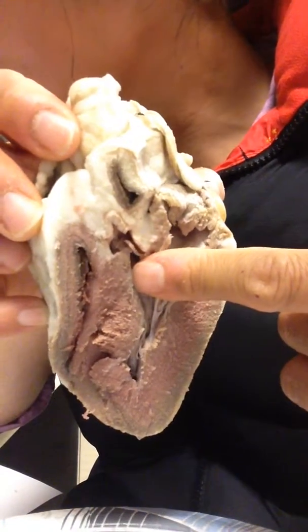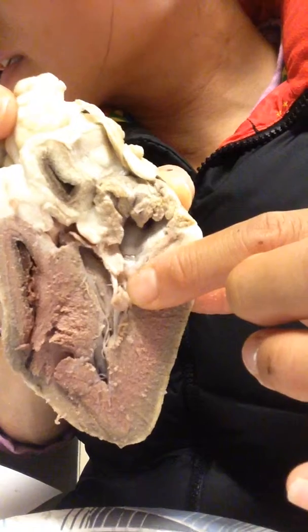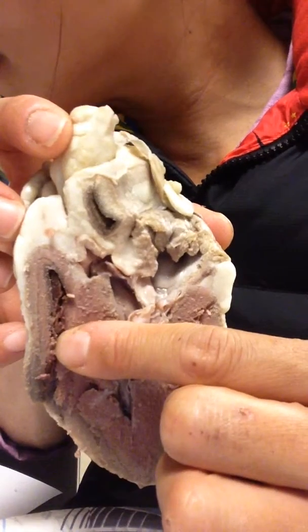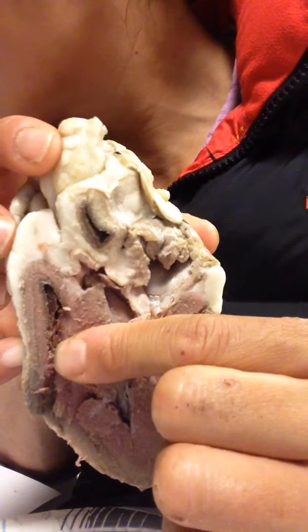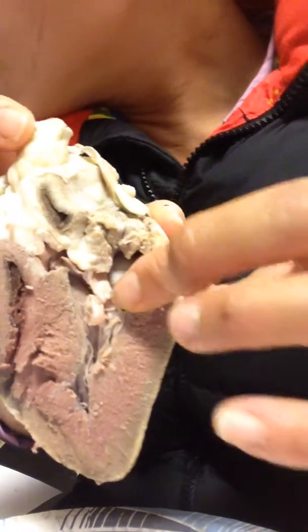Okay, 4 and then 5 is the bicuspid valve. The bicuspid valve is on this side. Let's see, it's somewhere in here. And then number 6 is the tricuspid valve, and that is on the other side, which is on this side. And then the next one is the chordae tendineae. The chordae tendineae is just above the interventricular septum, the center that I pointed out previously. So it is on this side, right above the interventricular septum.